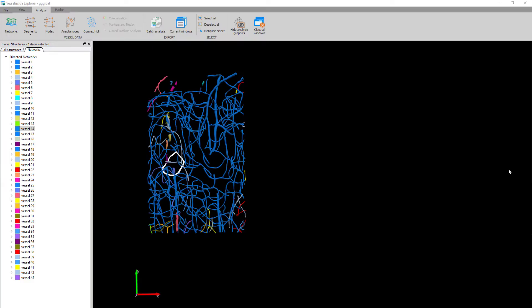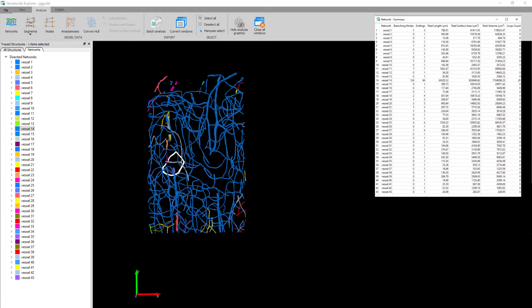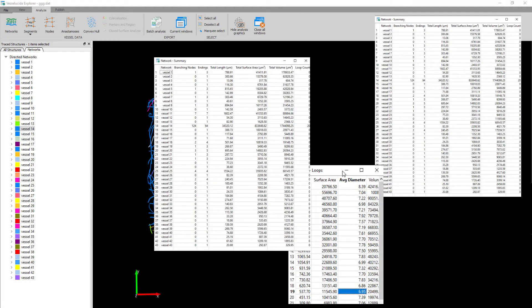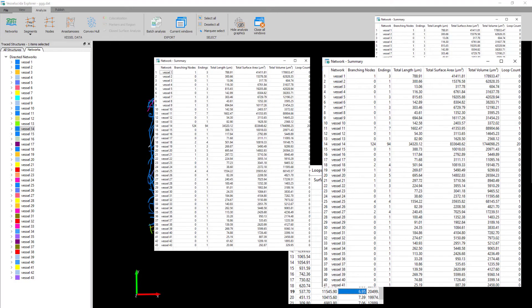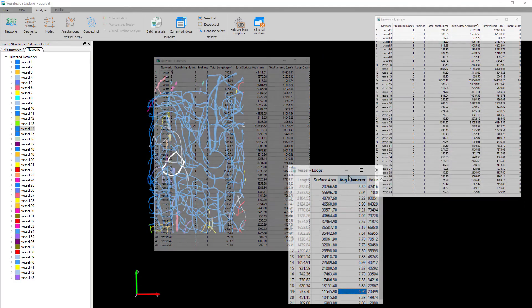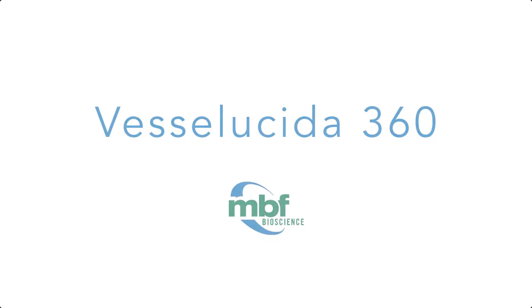Don't forget to analyze your data in Veselucida Explorer. Veselucida Explorer provides you with the most comprehensive analytics. You'll be able to see individual network summaries, individual loop analysis, node details, and diameter details from each vessel segment. Veselucida 360 is the researcher's first choice because it was made by researchers for researchers. Try it free today!